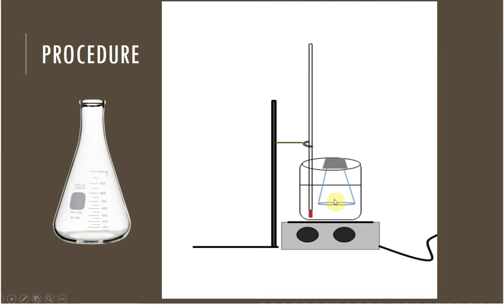You're going to do that for, I think the procedure says between two and five minutes. What you're really going to look for is for the little bit of liquid down here to disappear by your sight. And then you're going to wait about 30 seconds longer. It's going to be kind of hard to see that. These flasks have a little convex shape to the bottom. So sometimes an air bubble can get trapped under there. So you want to make sure that you're not looking at an air bubble.